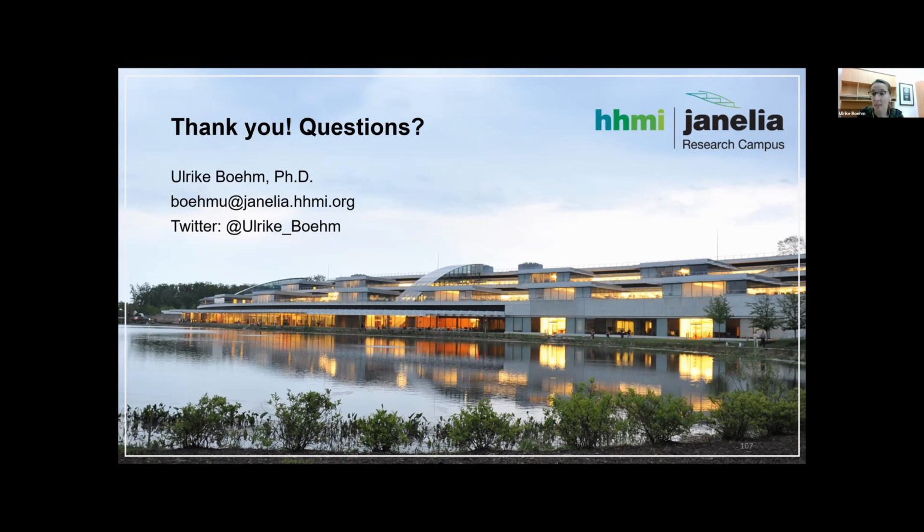But there are also other processes, for example RESOLFT or other kinds of mechanisms, in particular when you parallelize this technique or when you are way more efficient to get rid of background signals. So it's really hard to predict, because I know that there's lots of work going on in different types of fields. But I would not narrow this down to a specific technology, because they all have their specific hardware advantages and disadvantages.